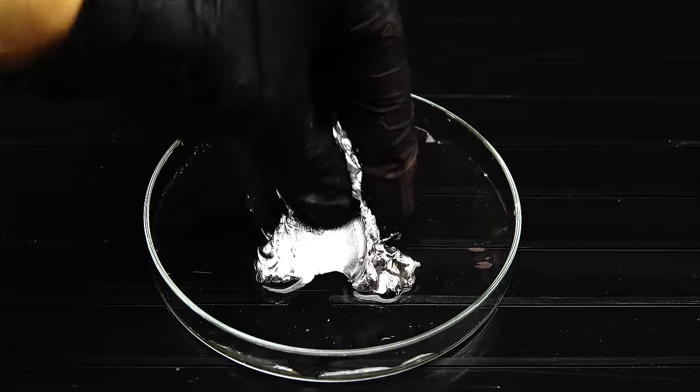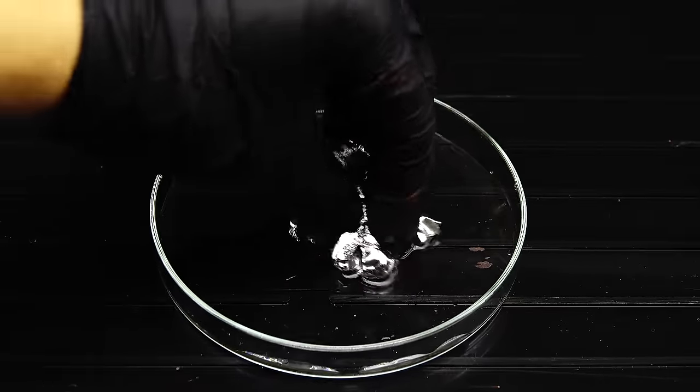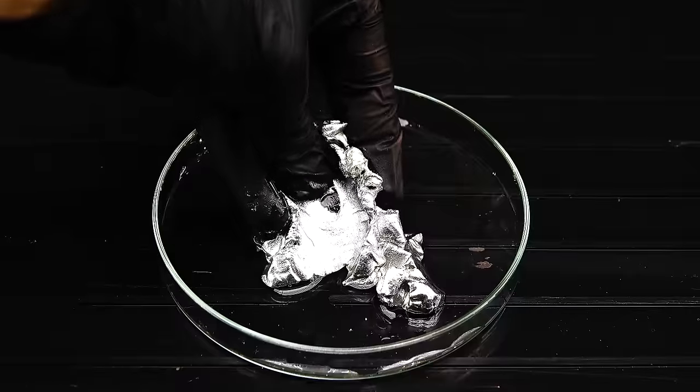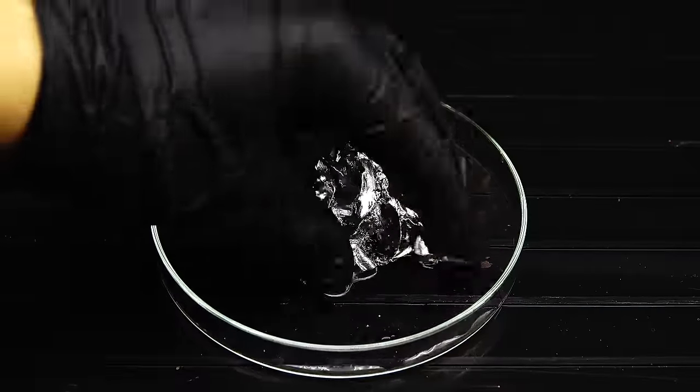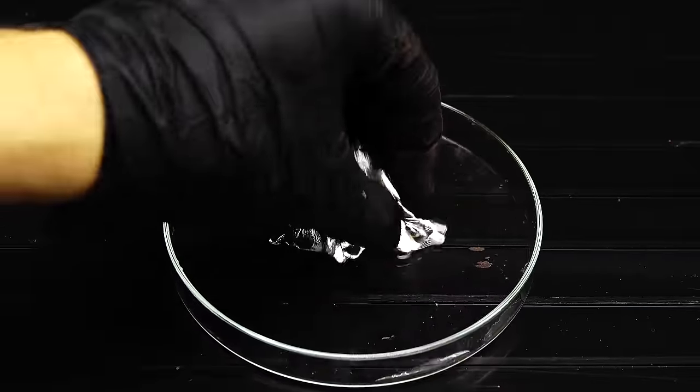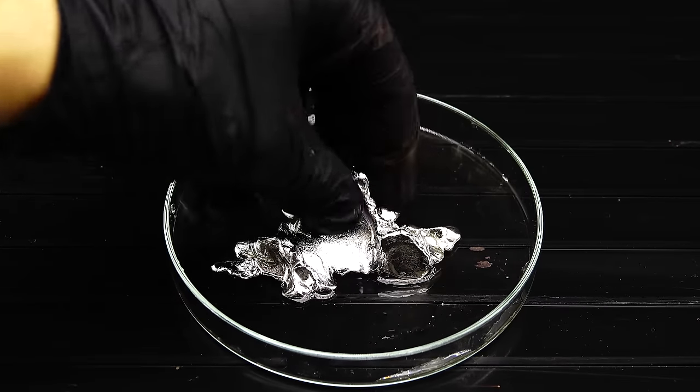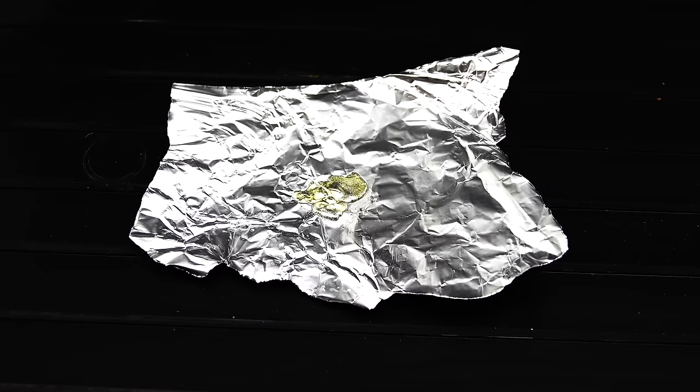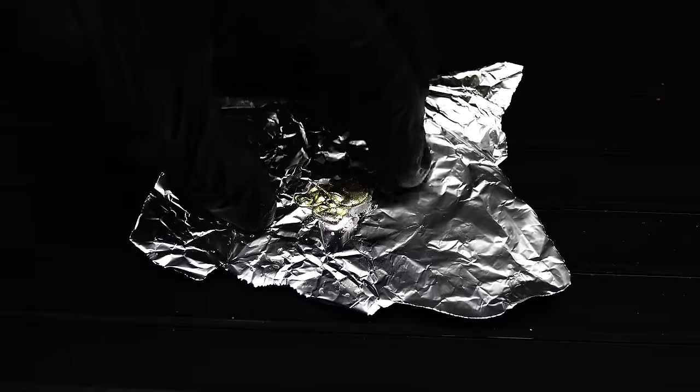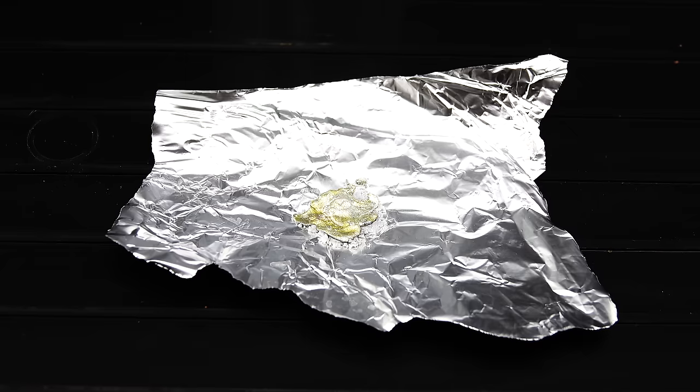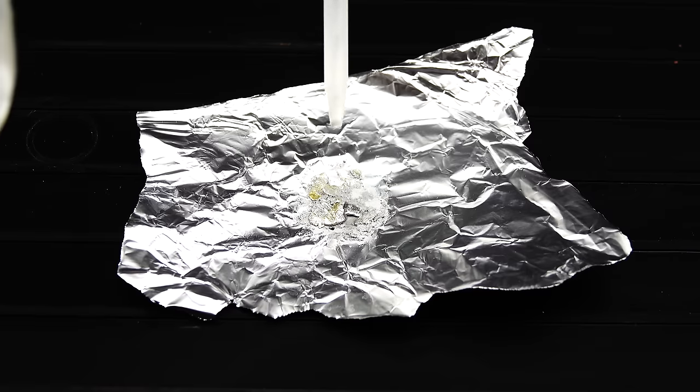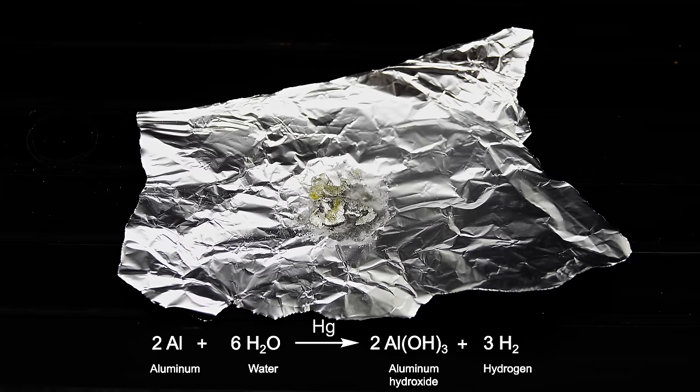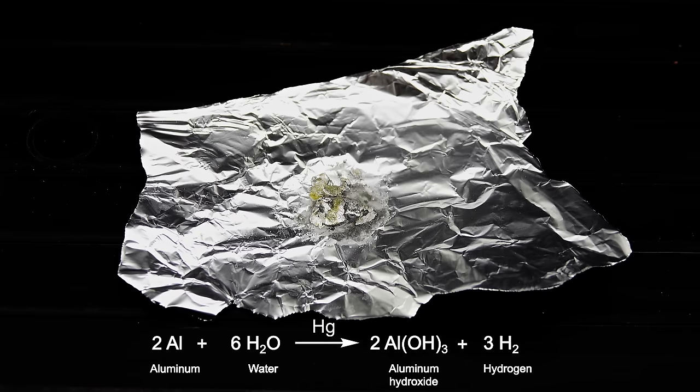Anyway, I also wanted to test out how the amalgam behaves in contact with aluminum, because usually mercury can leach into it forming this weird brittle structure. To initiate this process, some acid is often used to strip away the protective oxide coating of aluminum, but I wanted to see if the amalgam can soak into it just by itself. To do that, I got a small bit of it onto some aluminum foil, and indeed after a few minutes, this weird grey matter composed mainly of aluminum oxide started to form. The interaction of mercury with aluminum also makes it vulnerable to water, which creates a lot of flammable hydrogen gas upon contact with its surface, highlighting aluminum's high reactivity when its oxide coat is removed.